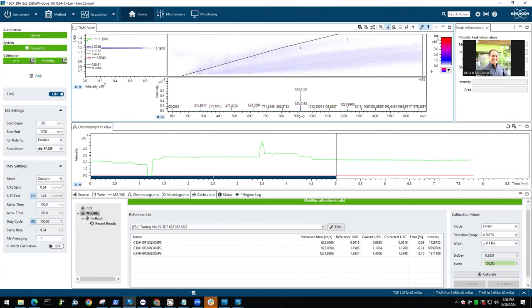Yeah, it's really like the gold standard thing, the calibration, is it fully validated? That should be good enough, actually, because you have quite wide tolerances for this, so you don't need to be 100% on this value. And even though they wobble a bit around, they are sometimes a bit higher, a bit lower, your windows are wide enough to account for this. But yeah, you shouldn't be too far away, because then you cut out half of your ion cloud, basically.